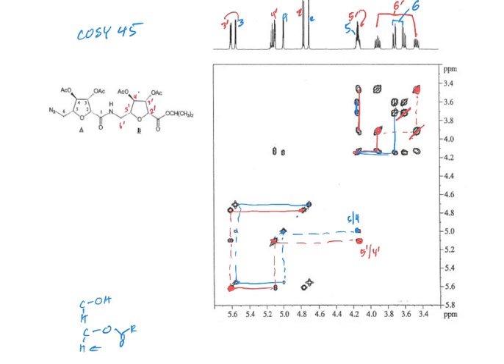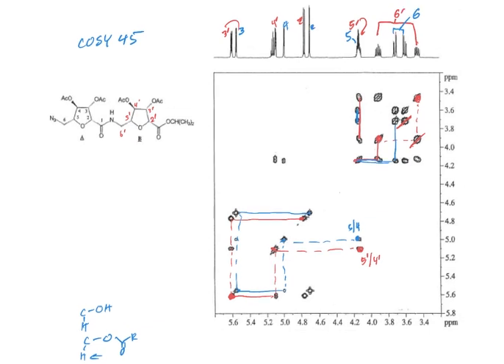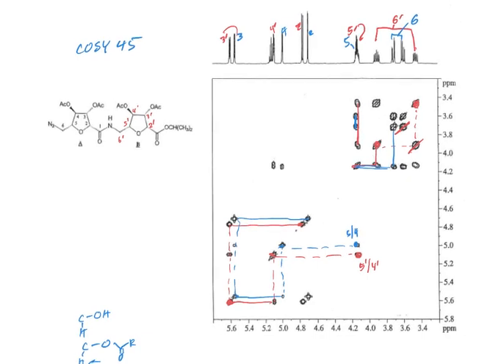I don't know why. Let's see here. It looks like there's something else. Looks like there's more peaks there, though. Or they're both doublets, I guess. They just have different sizes of splittings. Are you talking between the 3 and 4? Yeah, between these peaks. So this is a doublet and this is a doublet. But 2 prime to 3 prime and 2 to 3, I guess, have slightly different coupling constants, and so that's why they look a little bit different there.